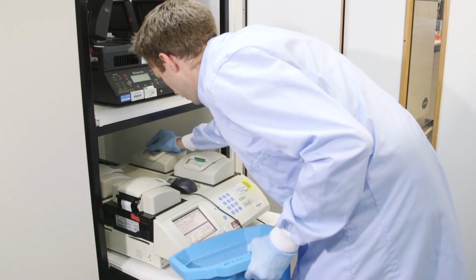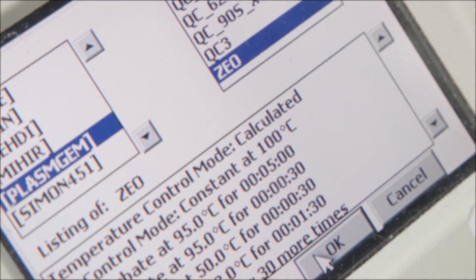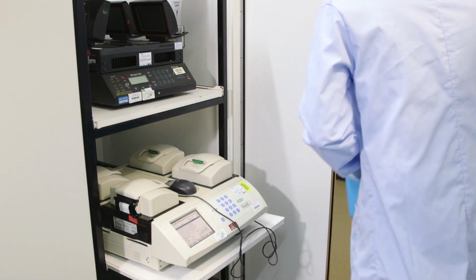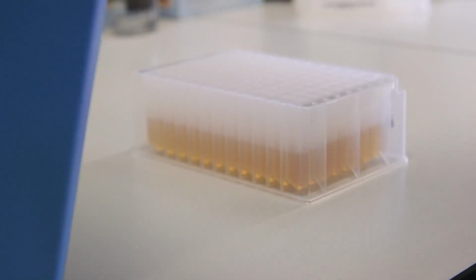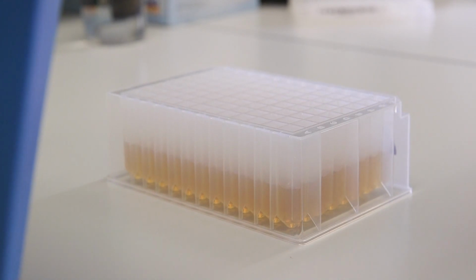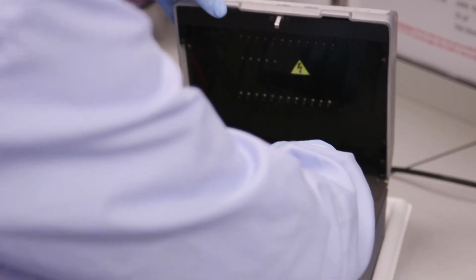Now each well contains DNA fragments with the same resistance marker genes, known as a resistance cassette, but the ends of these fragments differ, and those will later guide the finished vector to a specific target gene in the parasite. These ends are the oligonucleotides we designed earlier. Next, a crucial step called recombineering happens in bacteria. Each of these bacterial cultures harbors a specific short piece of malaria DNA that contains an individual target gene identified at the design stage. The product of the earlier PCR reaction is then shot into these bacterial cells using an electroporation machine.